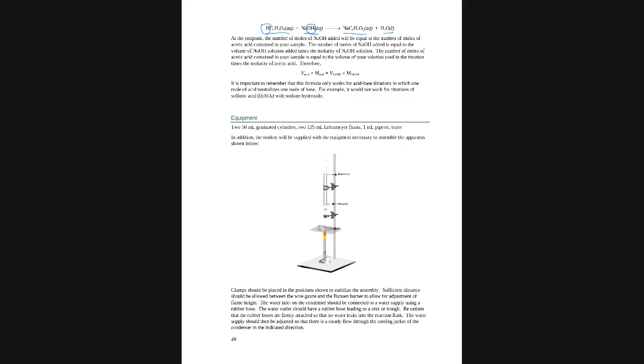We are looking for the molarity of the acid. That's all we want: the concentration of acetic acid. If we do it initially, we want the initial concentration of acetic acid. If we do it at the end, we want the equilibrium concentration. But it's always the same kind of titration, so this is very easy. If you are in the lab, you are going to do it and have that volume. But because you're not in the lab, the data will be given to you.